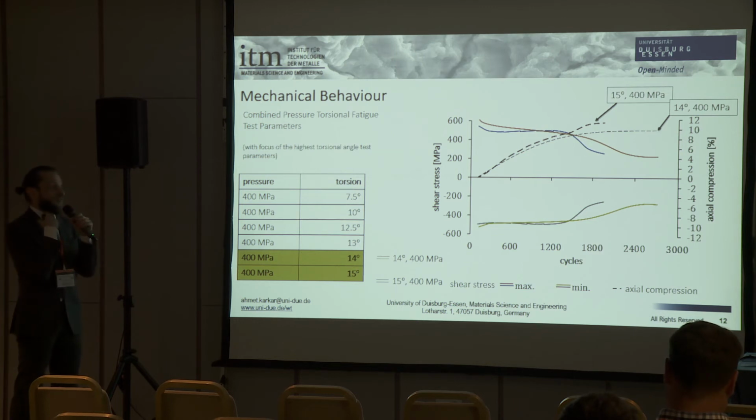Here the actual compression is under 10%. So we can see plastic strain takes place both cyclic accumulated and axial compressed.